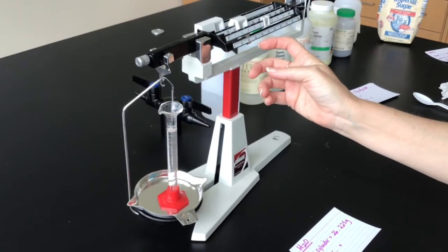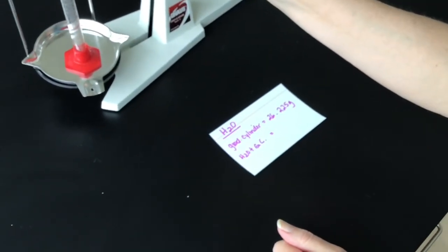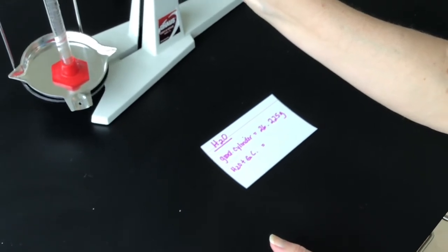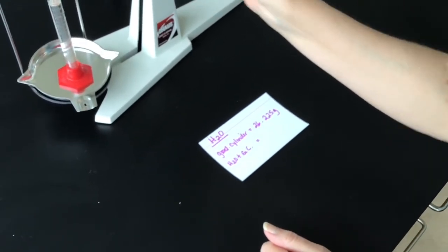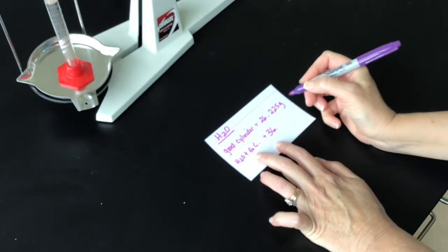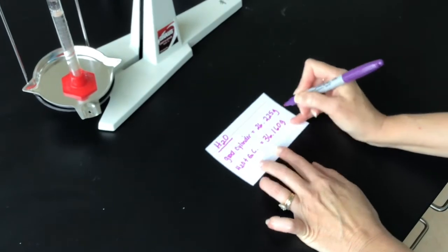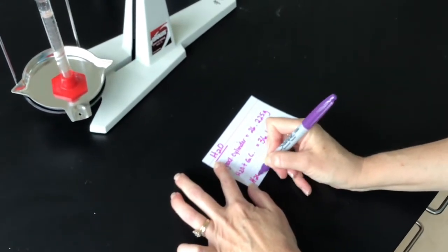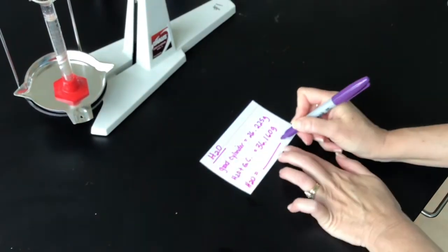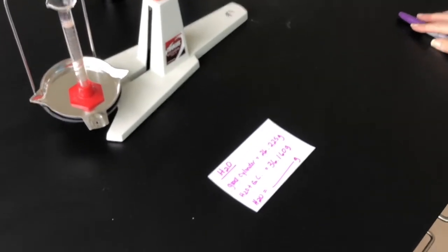Oops. So let's get this there. Trying to get as close as I can. All right, so that looks good. It looks like it is 36 grams, so 36.160 grams. And as we did for the solid, you're going to have to find the mass of just the water using massing by difference. Okay, so that's the water. And now I'm going to do the rest of them quickly, just give you the data so you don't have to listen to me talk.